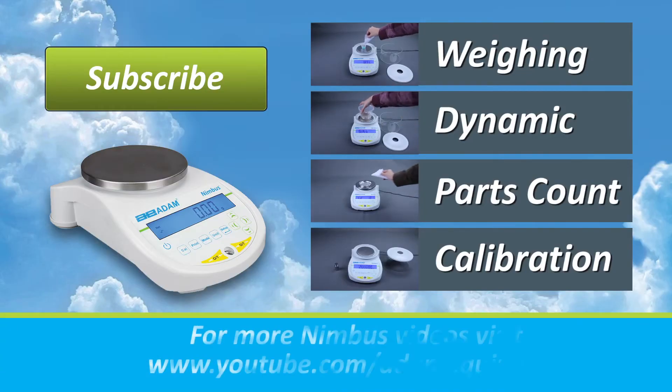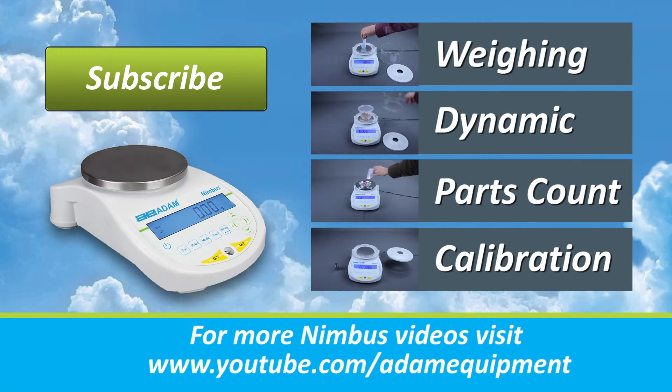Be sure to watch the entire Nimbus video series including videos on weighing, dynamic weighing, counting and calibration.